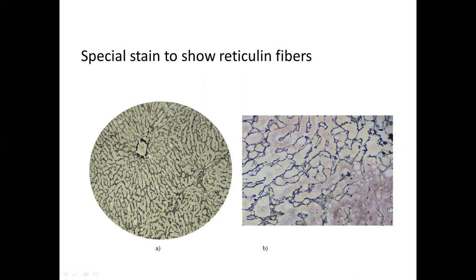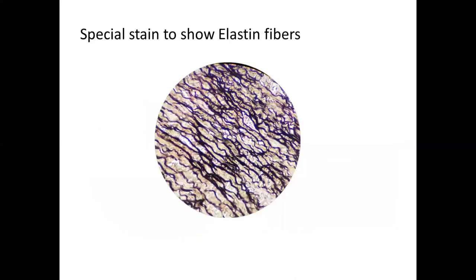Here is the low power view and the high power view to illustrate special stains. This is a special stain of the wall of the aorta to show elastin fibers. Elastin fibers in H&E will stain just pink, but here you see the wavy appearance of elastic fibers colored black, while the collagen fibers are stained in brown.